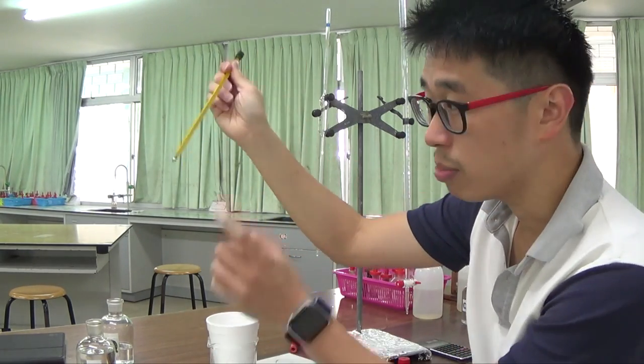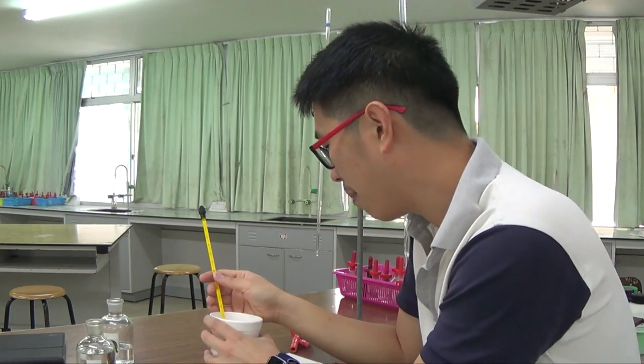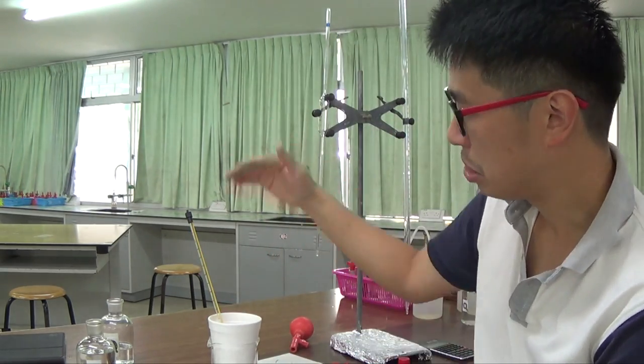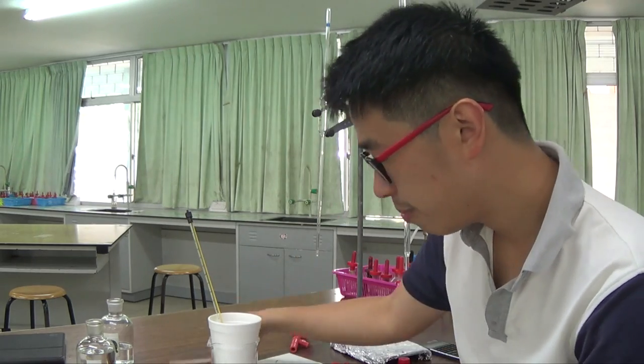I'm going to put the bulb of the thermometer in. This bulb actually measures the temperature of the solution in the plastic cup, okay? So you must make sure that the bulb of the thermometer is completely immersed in the solution. If it is not completely immersed, it's not going to record the temperature of the solution very well.